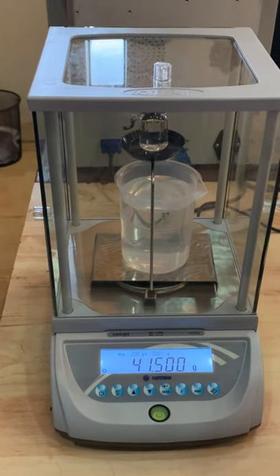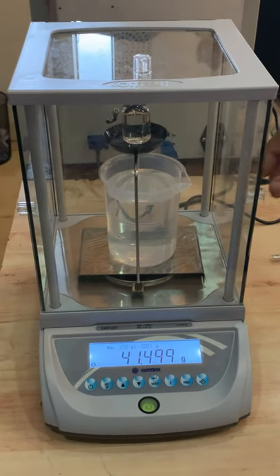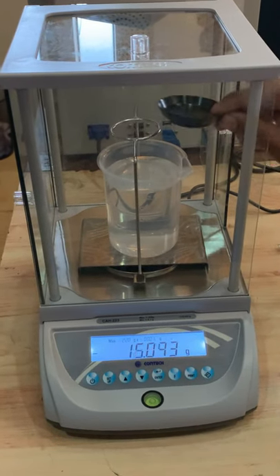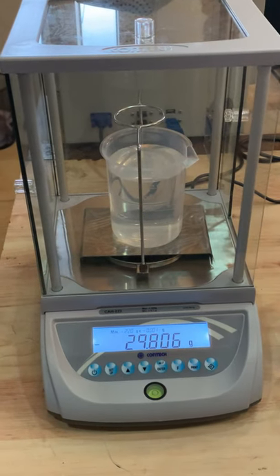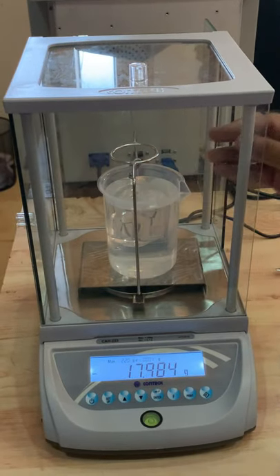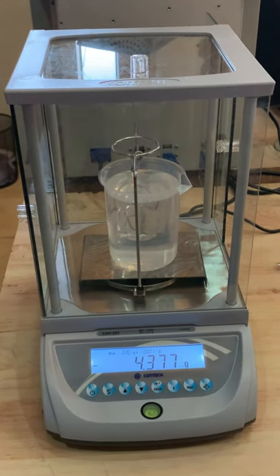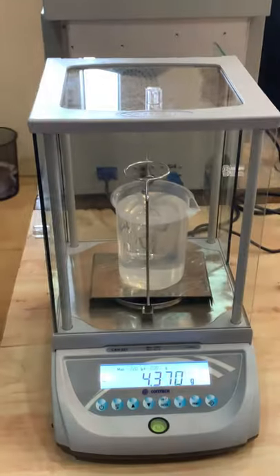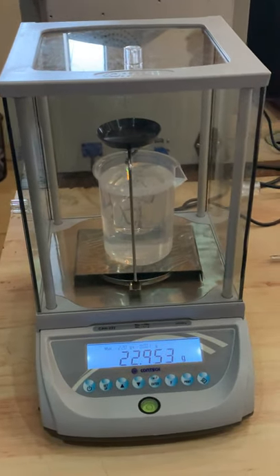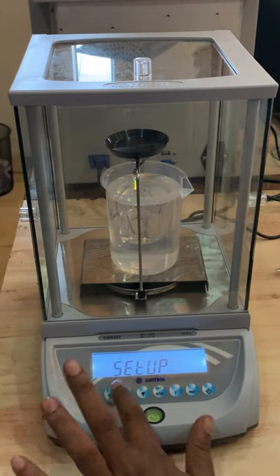Place the glass cube on the top pan and wait for the reading to be stable. Press setup and enter. Then hang the glass cube in the water pan and wait for stability. Press setup and enter.